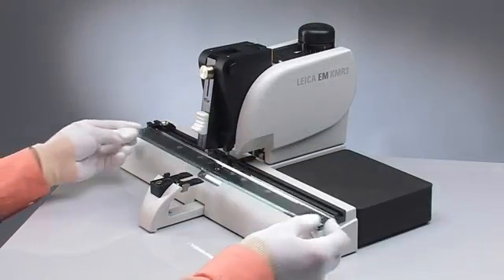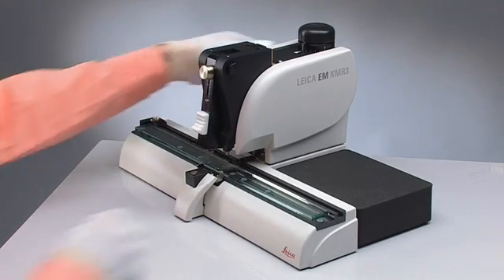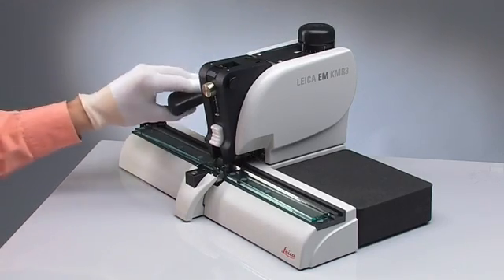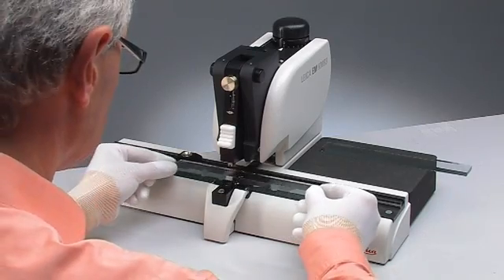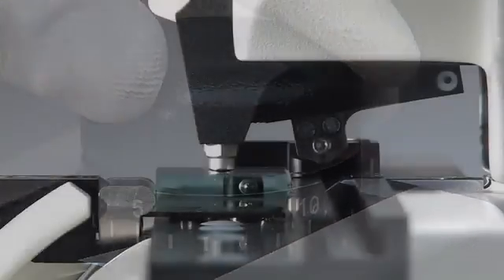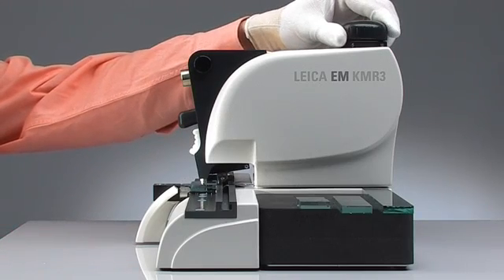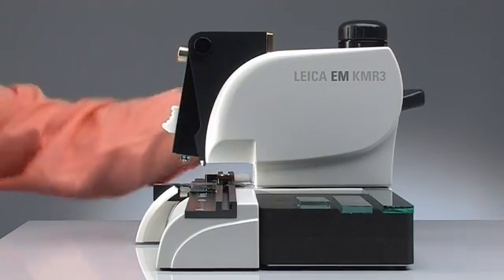Central to the new design of the KMR3 is the precise balancing of the instrument's mechanical components to produce a perfectly balanced break. The simultaneous movements of two breaking pins apply exactly the same force to both sides of the glass strip. In addition, high-precision steel hemispheres provide minimum glass surface contact for the best balanced break conditions to produce an unsurpassed knife edge quality.